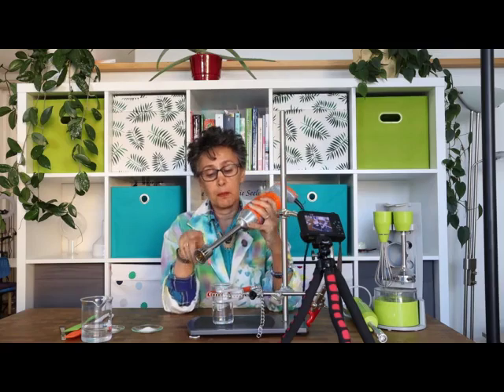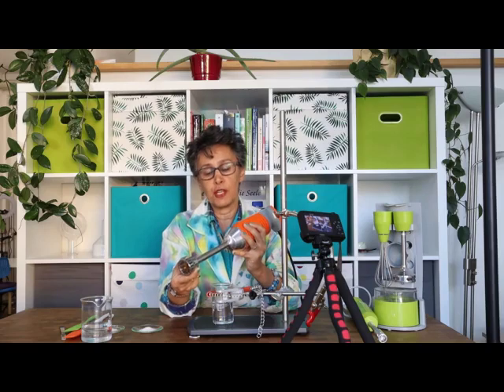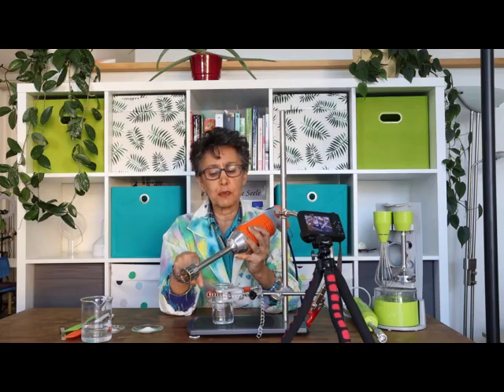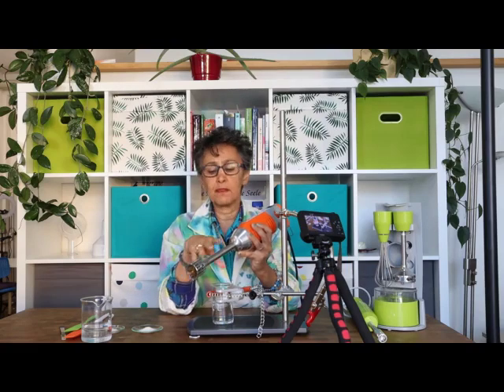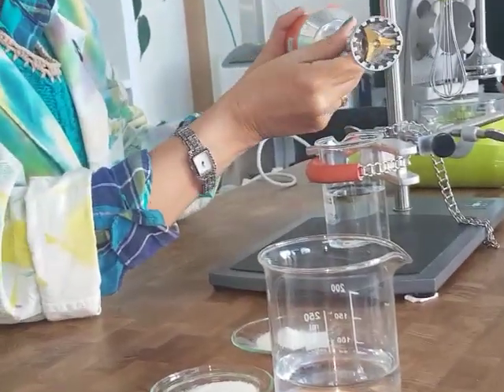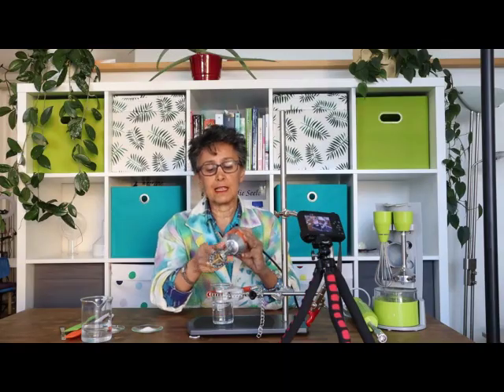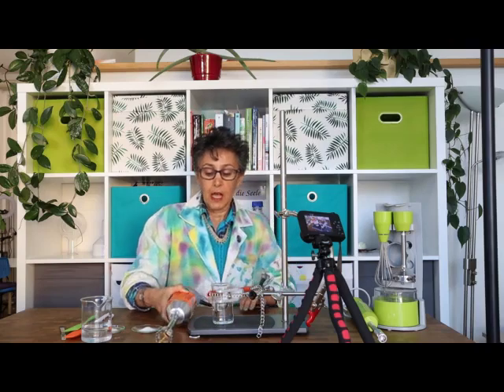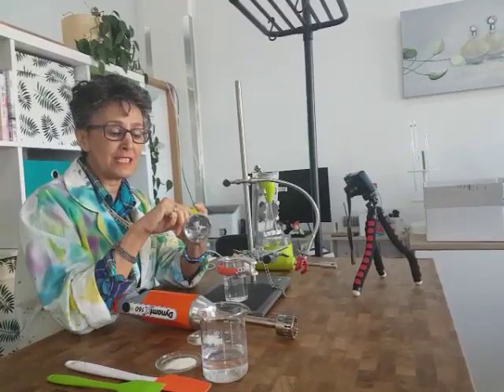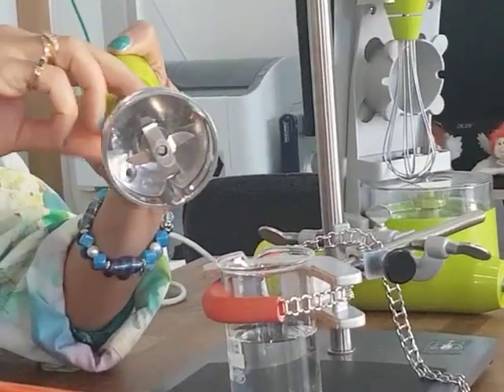Pay attention that when you purchase this tool you get the homogenizer or emulsification head. It is called turbo attachment, homogenizer, or emulsifier depending on your region, but this is what you need. This is the turbo homogenizer. It may come with a cutter blender attachment — pay attention that you don't get that one because it is almost useless in a cosmetic lab.